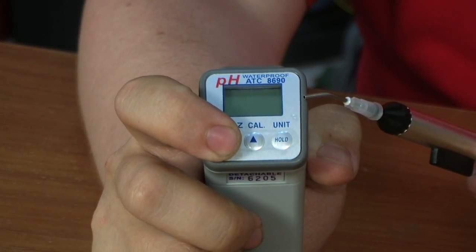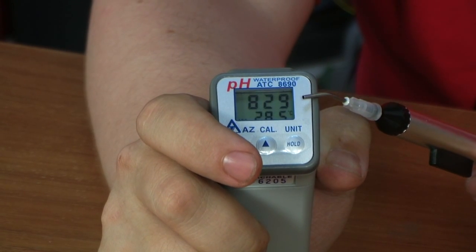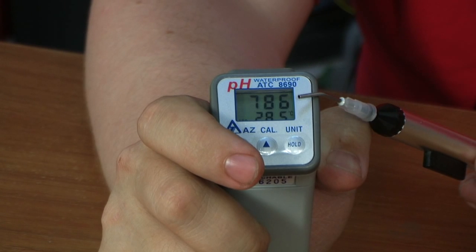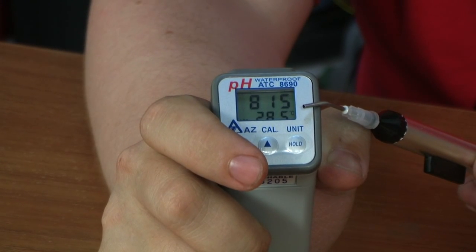The electrode should be placed in water for 30 minutes before taking any measurements. If the device has not been used for a long time, this step is especially important. Within one second after the device has been turned on, all the indicators on the display will light up. The pH measurements are shown on the main display. The additional display shows the temperature.